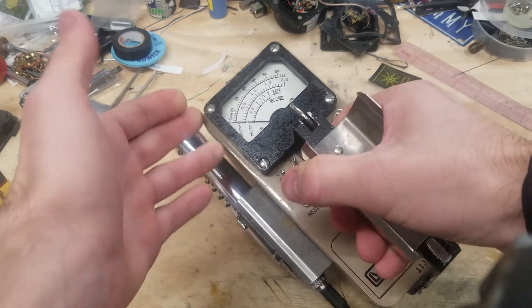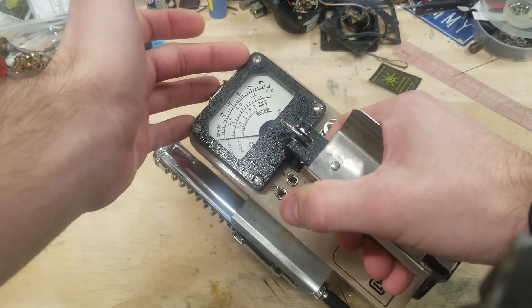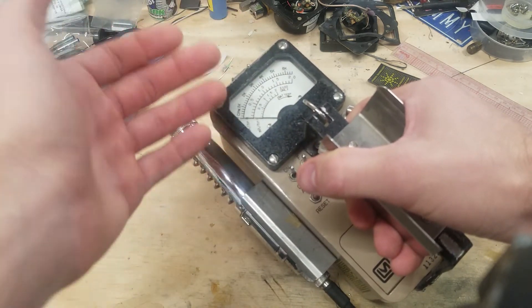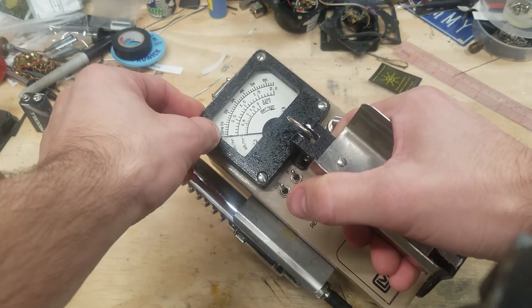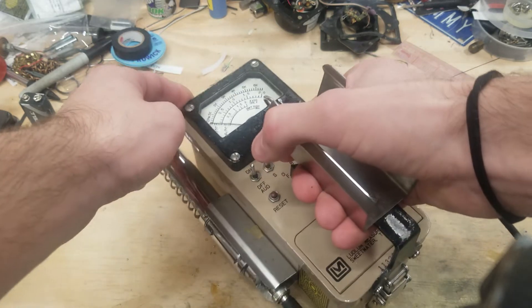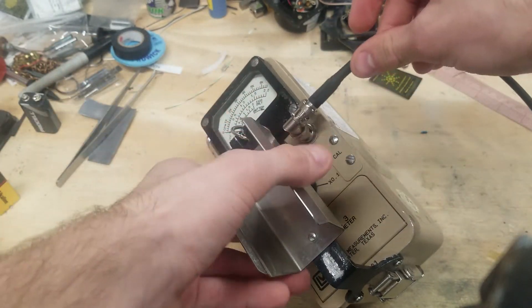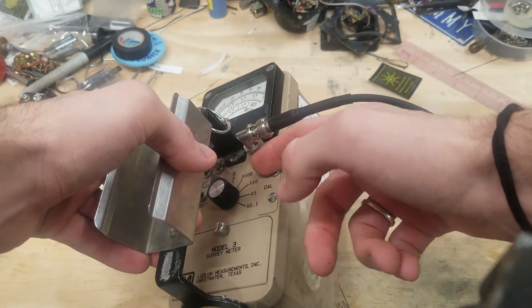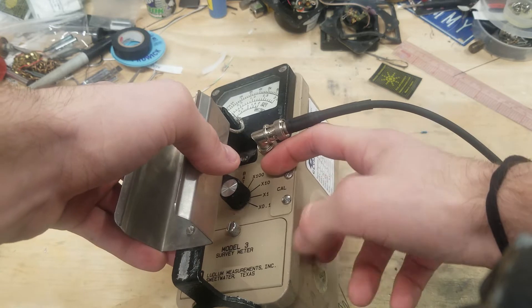It usually incorporates a multi-use scale with usually a higher range and a few dose ranges. Now this isn't always the case — some of them include just a count per minute scale or just a dose scale. The Model 3s also incorporate an extra range. Most Model 2s will only go to x10, while most Model 3s will go to x100.